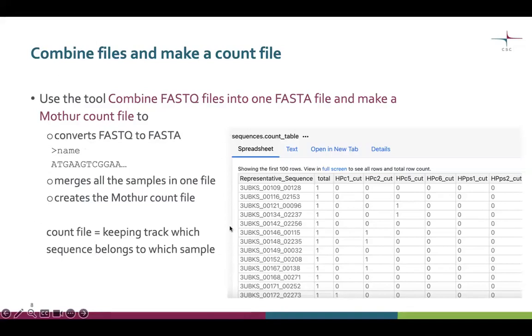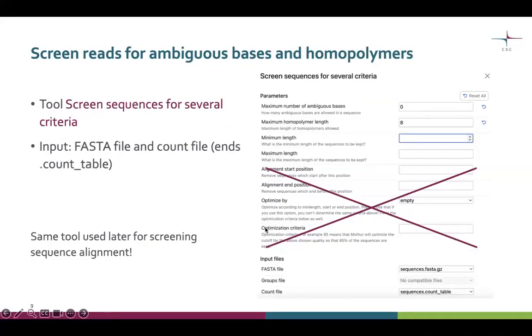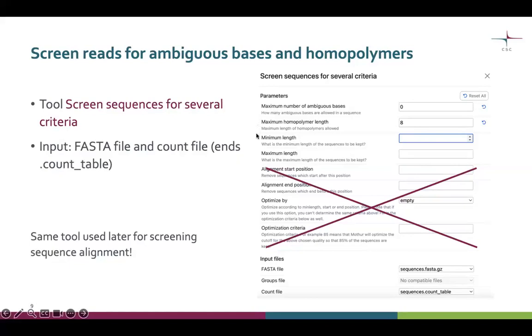Here is an example of a count file where the rows represent each individual sequence read and the columns represent all the samples. Next, we take the FASTA file and the count file from the previous step and use a tool called 'screen sequences' to filter for several criteria and get rid of ambiguous bases and homopolymers. It is important here that we give both the FASTA file and the count file, so that we have both the sequence information and the information about which sequence occurs in which sample. The parameters we need now are at the top of the window — for ambiguous bases, homopolymers, and possibly minimum length.